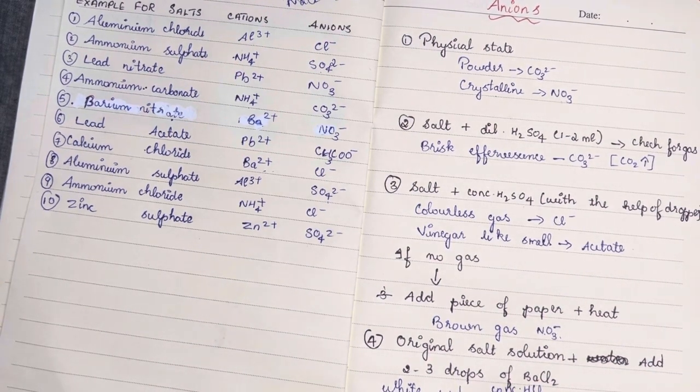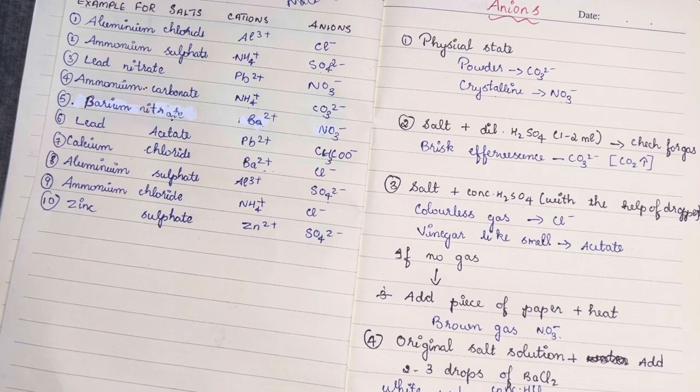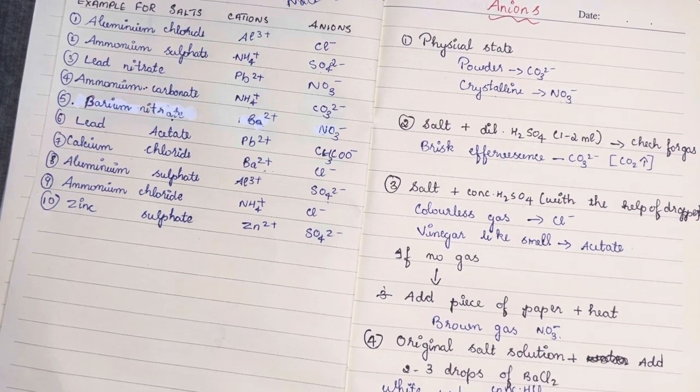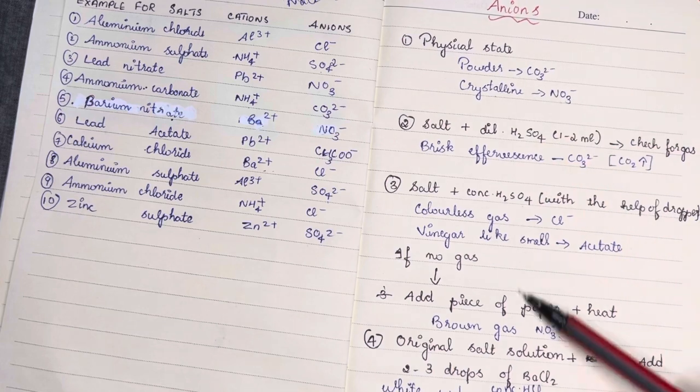I hope you're clear with this. The examiner will be providing the different salts, and from the salt you have to detect which is the cation and which is the anion. There is a separate test for the anion and a separate test for the cation. In order to detect the anion, first we have to do all these tests.